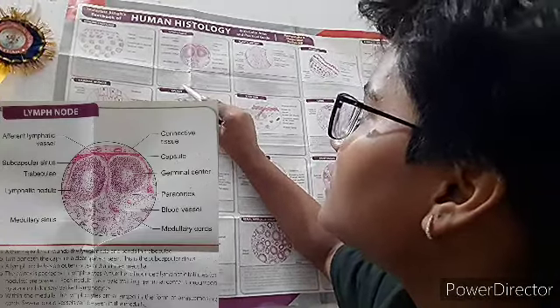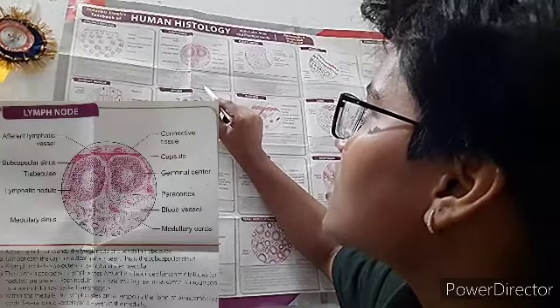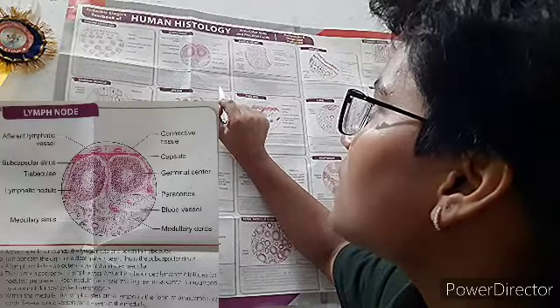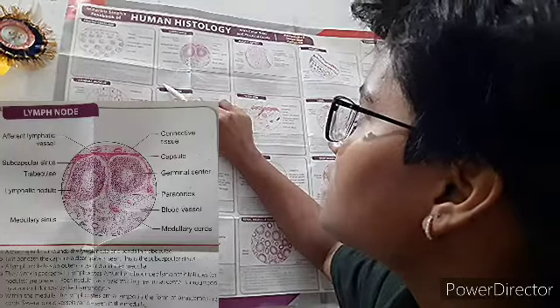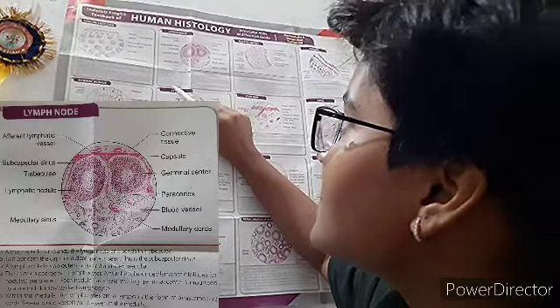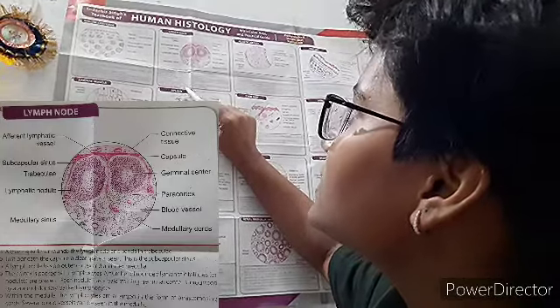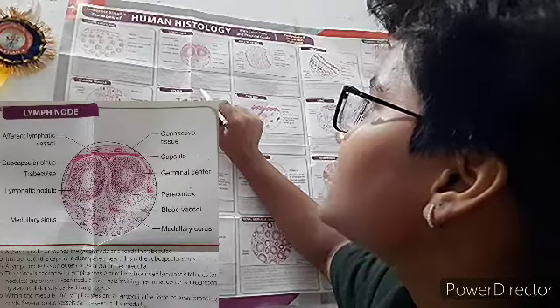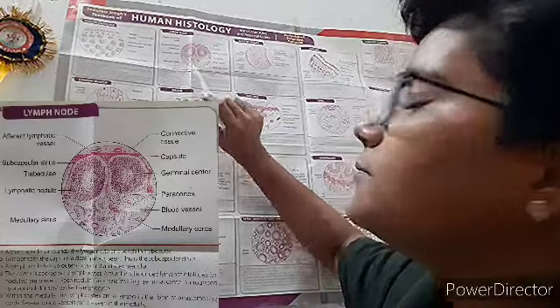Within the medulla, the lymphocytes are arranged in the form of anastomosing cords. Several blood vessels can be seen in the medulla.